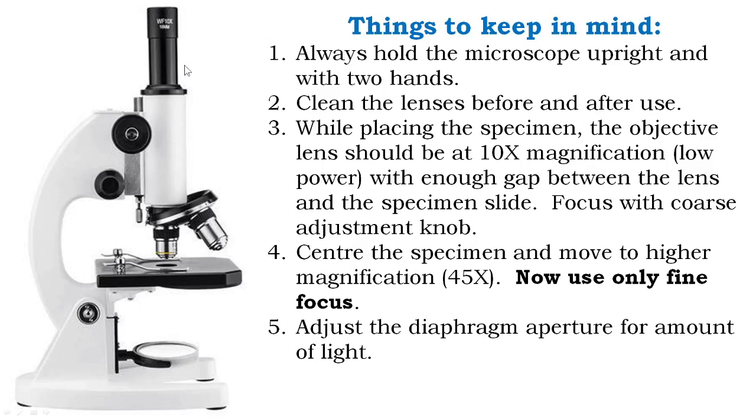be upright. Tani upright khajin jugu gora labim bai na manju gi dela eyepiece la di da khangi gi dela objective lens la niyor la so eyepiece la di kisi gurdin lobe mana ma thoyung gurda ho. So you have to hold the microscope always upright. If you tilt it, if you just put it upside down, then the lenses will fall out. Lens ma tha yungurda. Lens ma tha wain bana chagar khajin ko shewo so yor wa. So this thing is important.